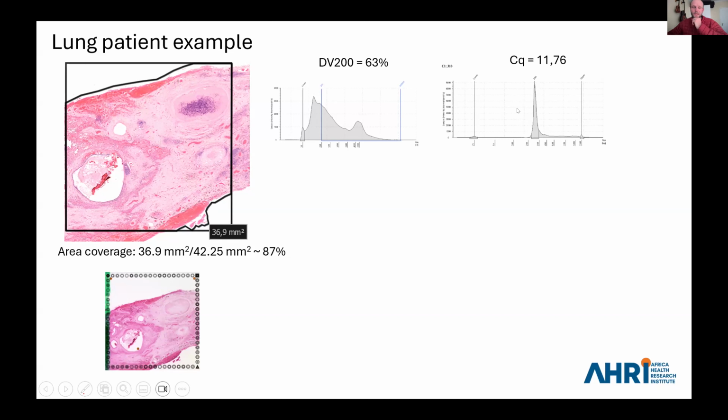to 260 base pairs. And what's really important is that you want a very low Cq value when you do the qPCR on your amplified library. You want a very low Cq value. And also very important is that you have a very clean SPRI selected peak. So you don't want any smaller size fragments in this purified sample.